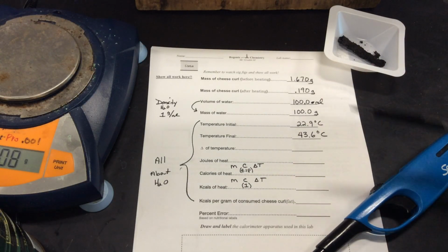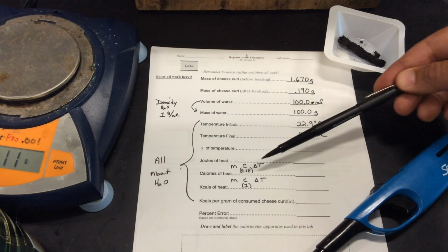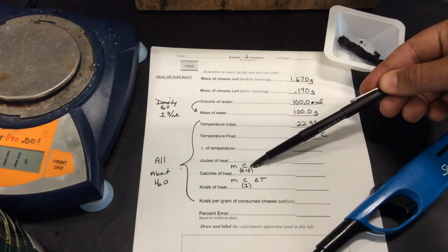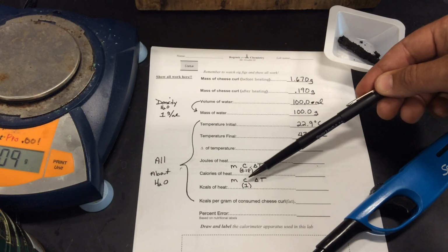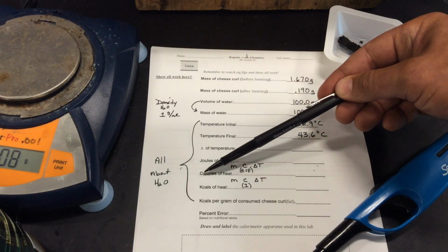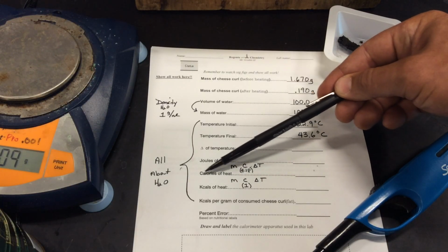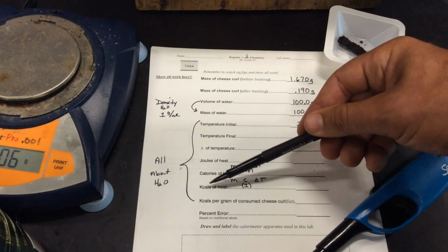That's why they call it calories. In any case, I want you to solve for joules using the 4.18 joules per gram per degree Celsius specific heat. Then I want you to solve for calories using the specific heat of 1. Okay. Convert. Now I have big C here. That should be little c. So regular calories is what you're going to get. Convert this number of calories to kilocalories.